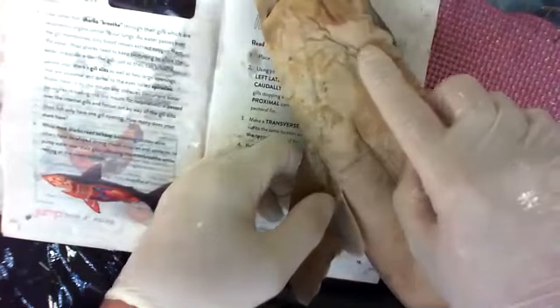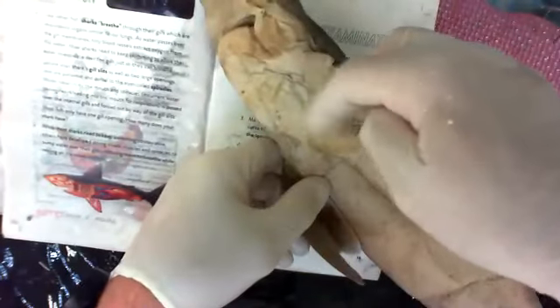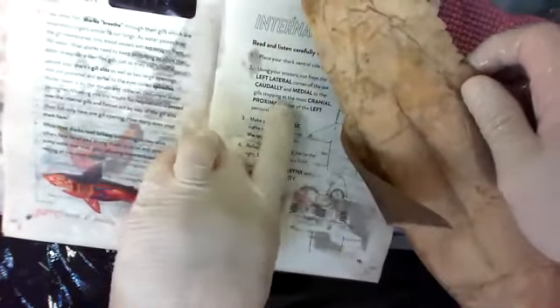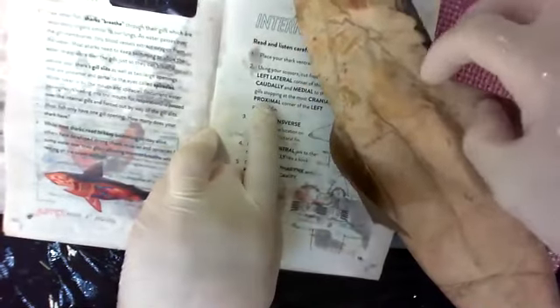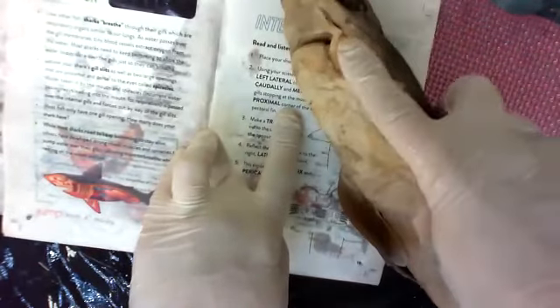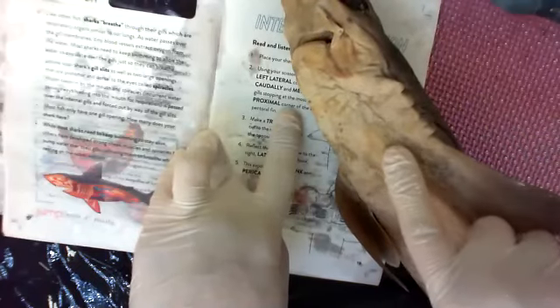We're going to go medial to the gills. It says medial to the gills. So this side of the gills. Don't cut through the gills. Try to stay on this side of the gills. And we're going to go all the way down here to what would be the shoulder. And it's described as stopping at the most cranial, towards the head, proximal, close to the body, corner of the left pectoral fin. So the cut is going to come from the mouth on the left corner, staying close to the midline of the body around the gills, and we're going to stop right there at the shoulder.